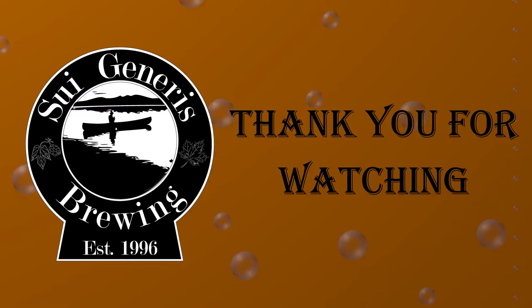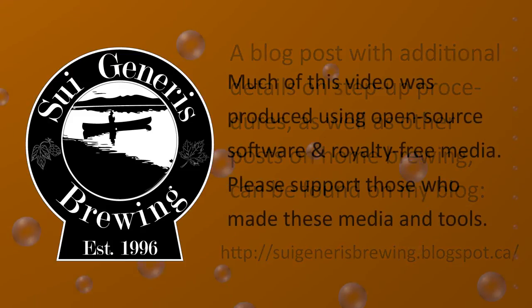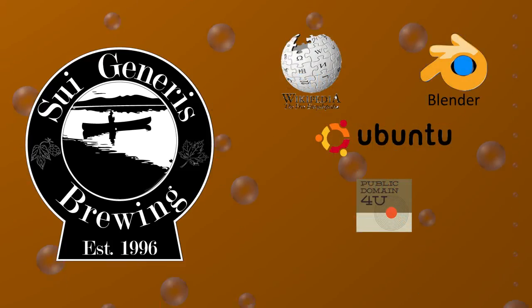So that's the first real video in my how-to-make-a-yeast-lab video series, simply showing you how to set up a proper work area for doing any kind of yeast work. Over the next few videos I am going to spend a little bit of time talking about some more advanced methods, such as making a streak plate, but eventually I will come back to actually just doing basic starters. Until next time.